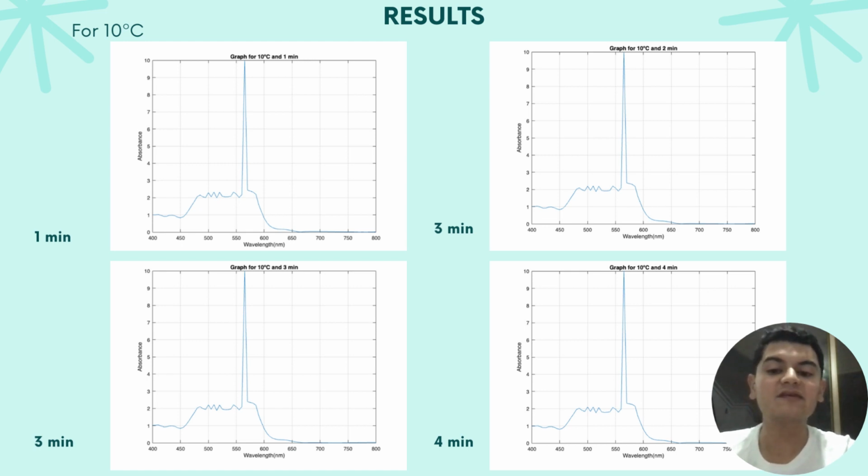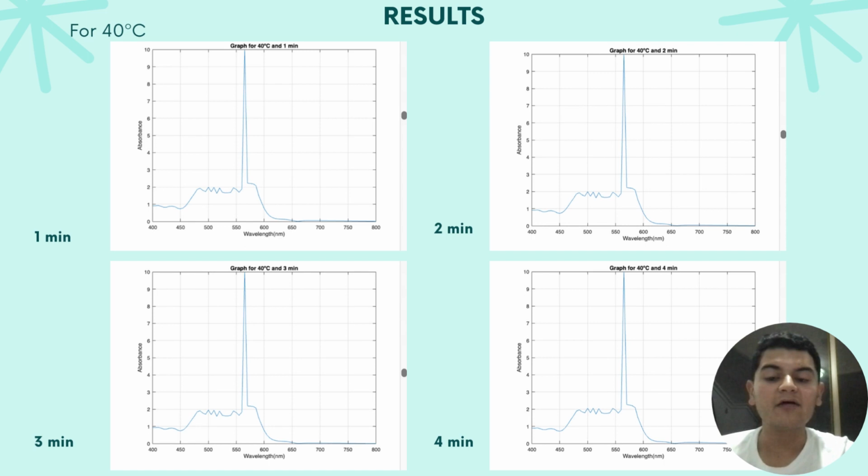And we can also see the highest point of absorption is around 560 nanometers. We find that highest point later.